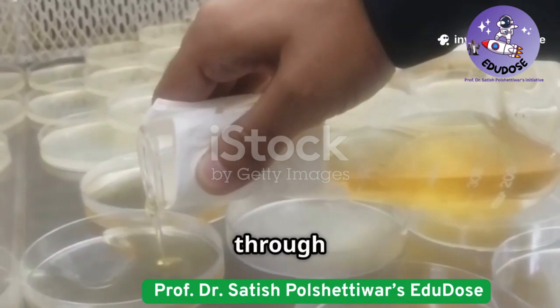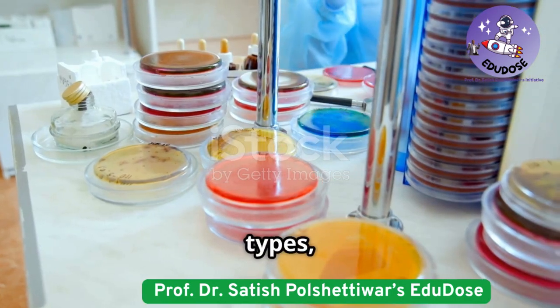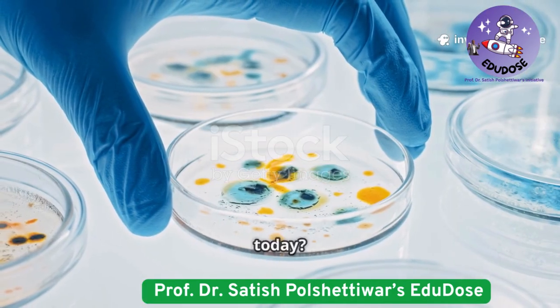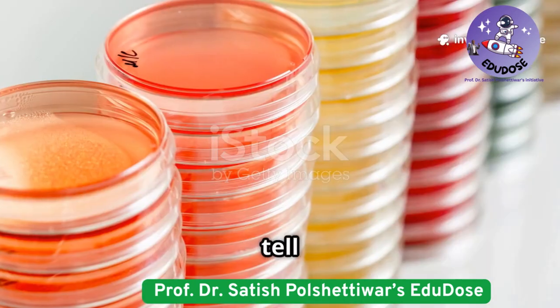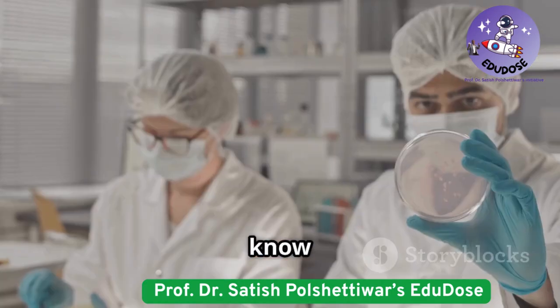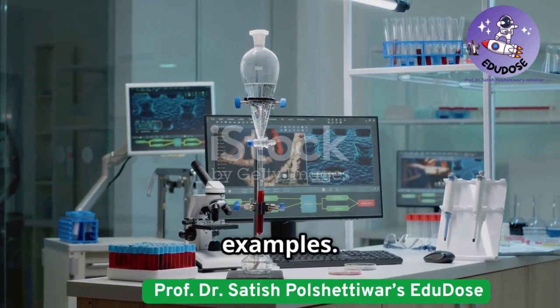I'm here to walk you through one of the essential foundations of microbiology: culture media, their types, and how we maintain them in labs. So, what are you going to learn today? By the end, you'll understand the purpose of culture media. Tell apart different types like selective, differential, and enriched media. Know how we keep cultures alive in the lab, and see how all this connects to real-world examples.